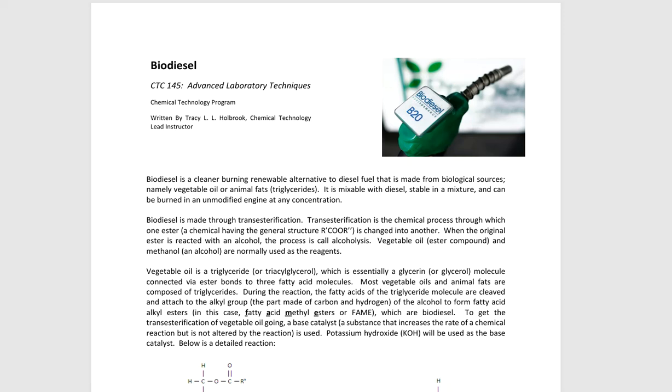So what you're seeing on the screen right now is a current version of our biodiesel lab, and I want to talk a little bit about what's going to happen hands-on in our lab environment, because you've already gone through lecture video after lecture video about biofuel and biodiesel and the whole importance of what this can bring to the table.